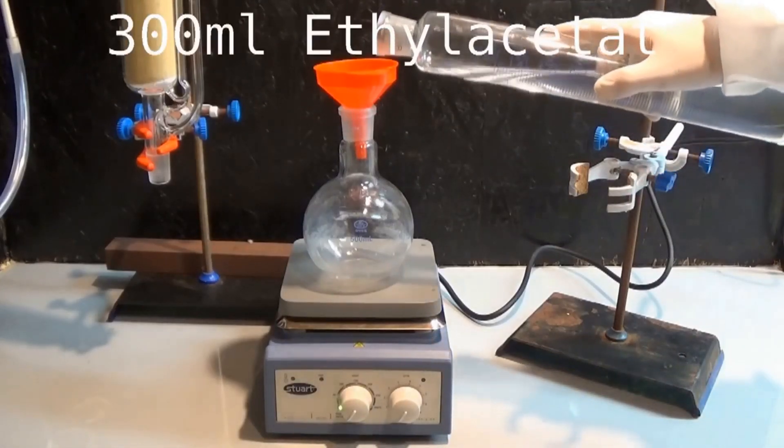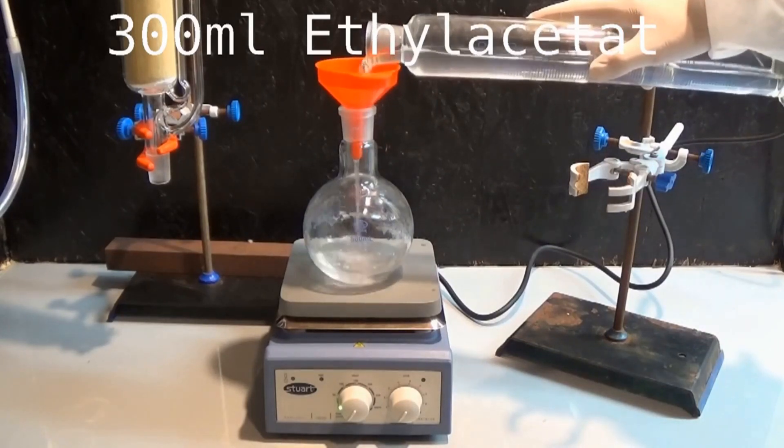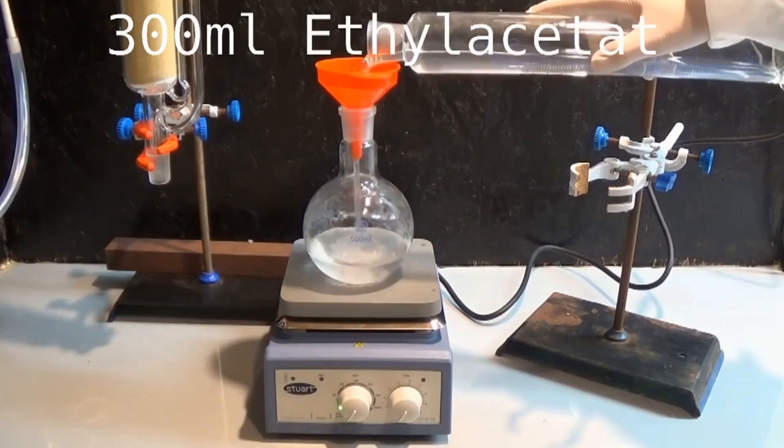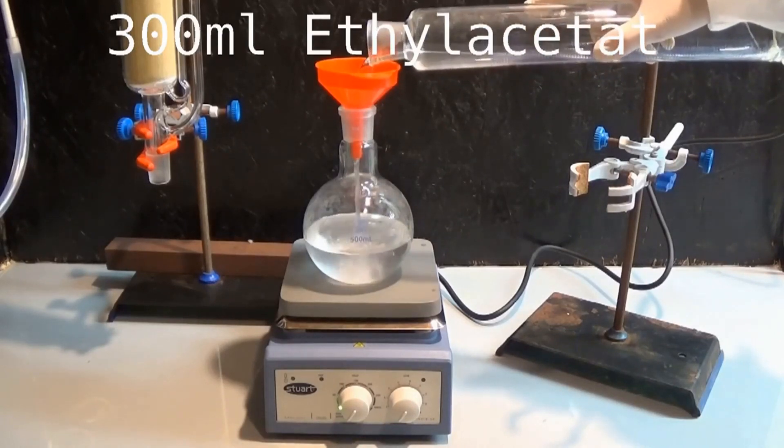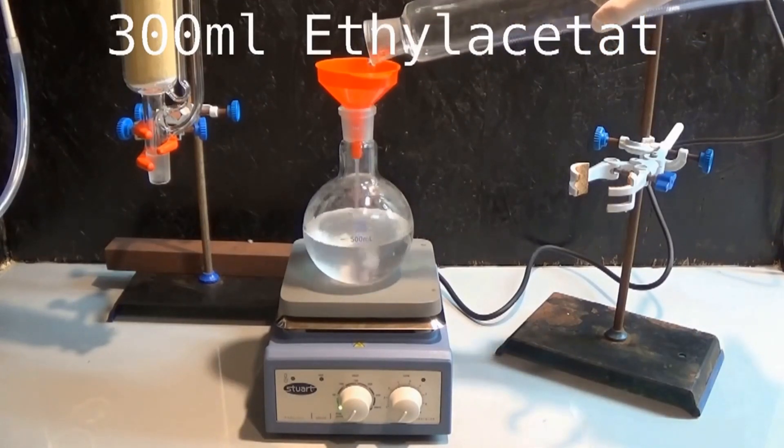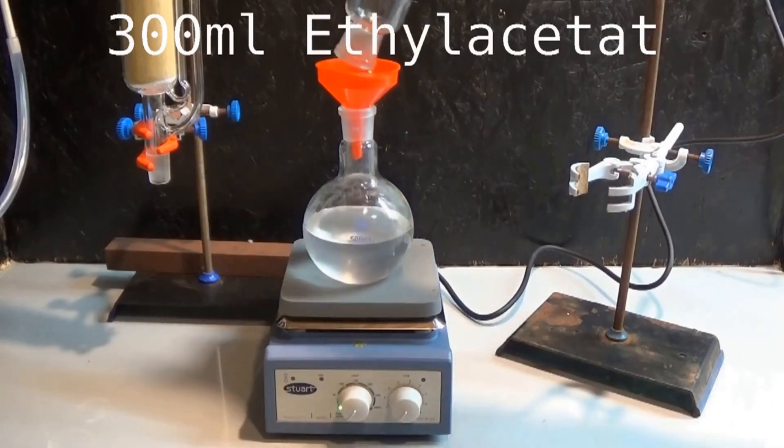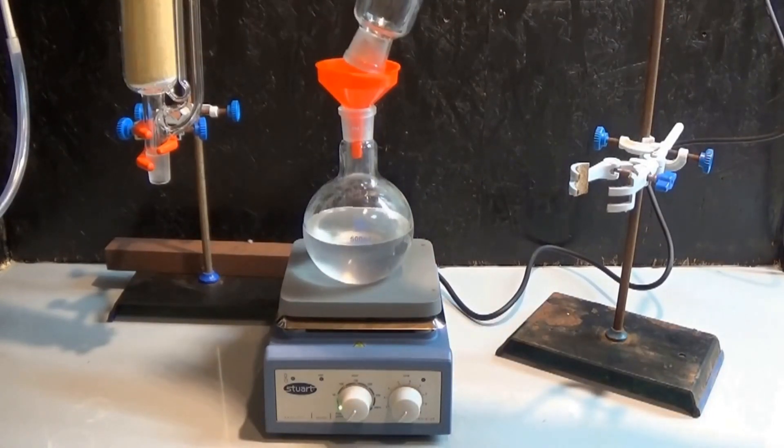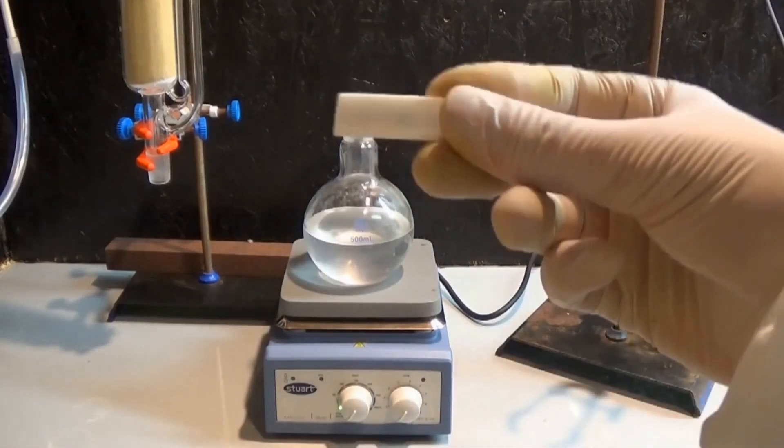As solvent, I chose ethyl acetate because it can be easily distilled from nail polish remover. The used ethyl acetate was pre-dried using three angstrom molecular sieves to get rid of any remaining water. 300 milliliters of dry ethyl acetate are added to the boiling flask, followed by a magnetic stir bar. Afterwards, the apparatus is assembled and connected to the cooling water.